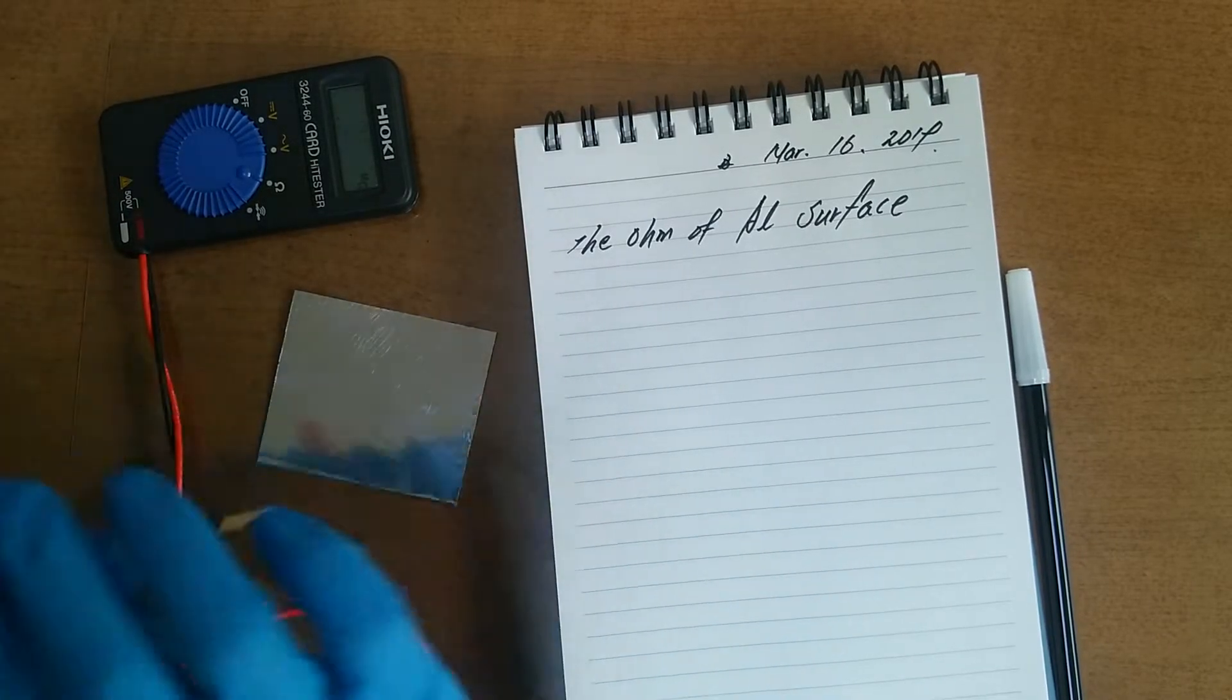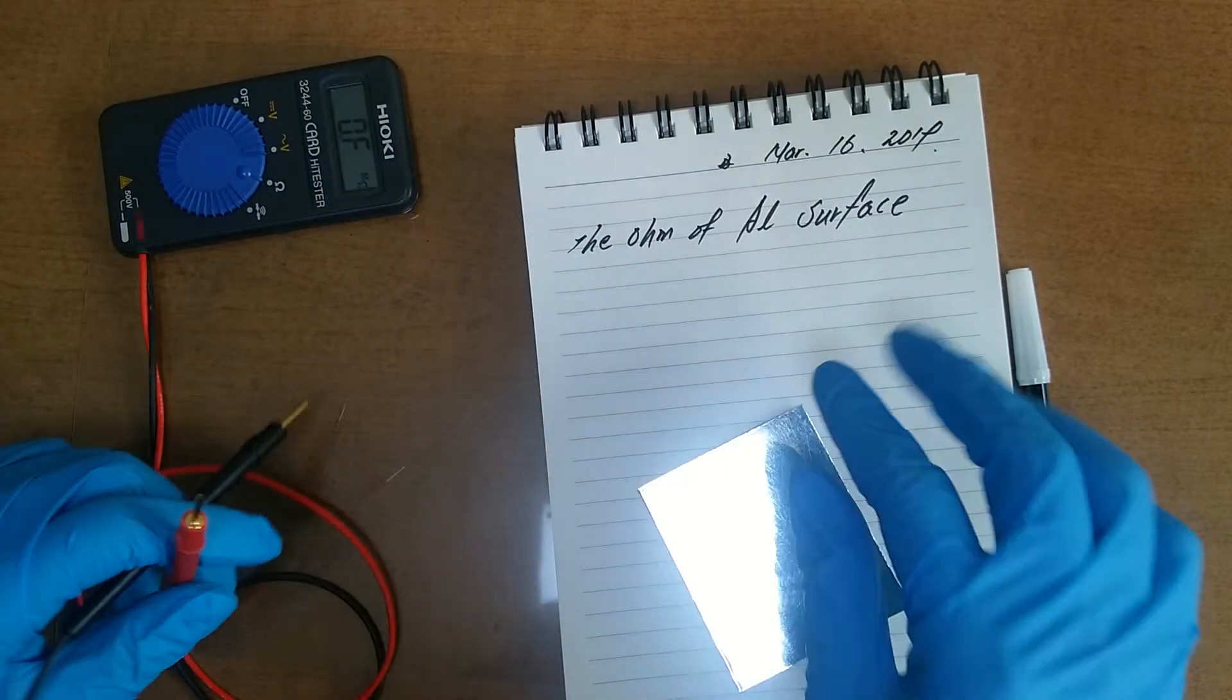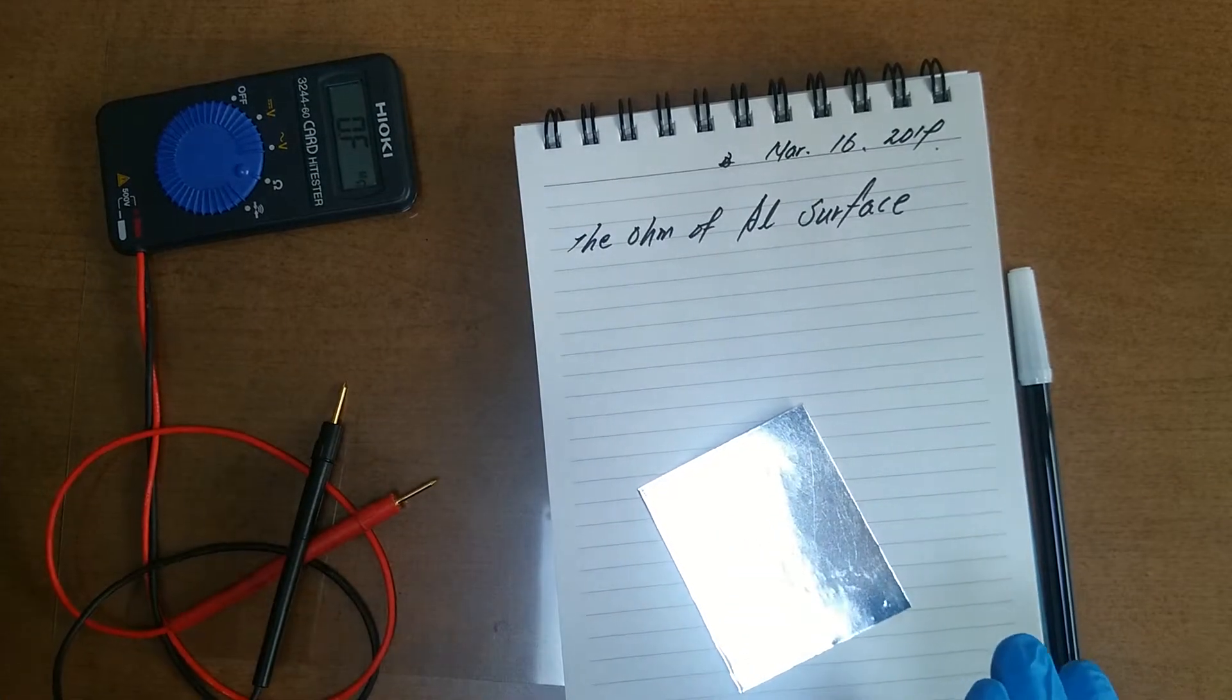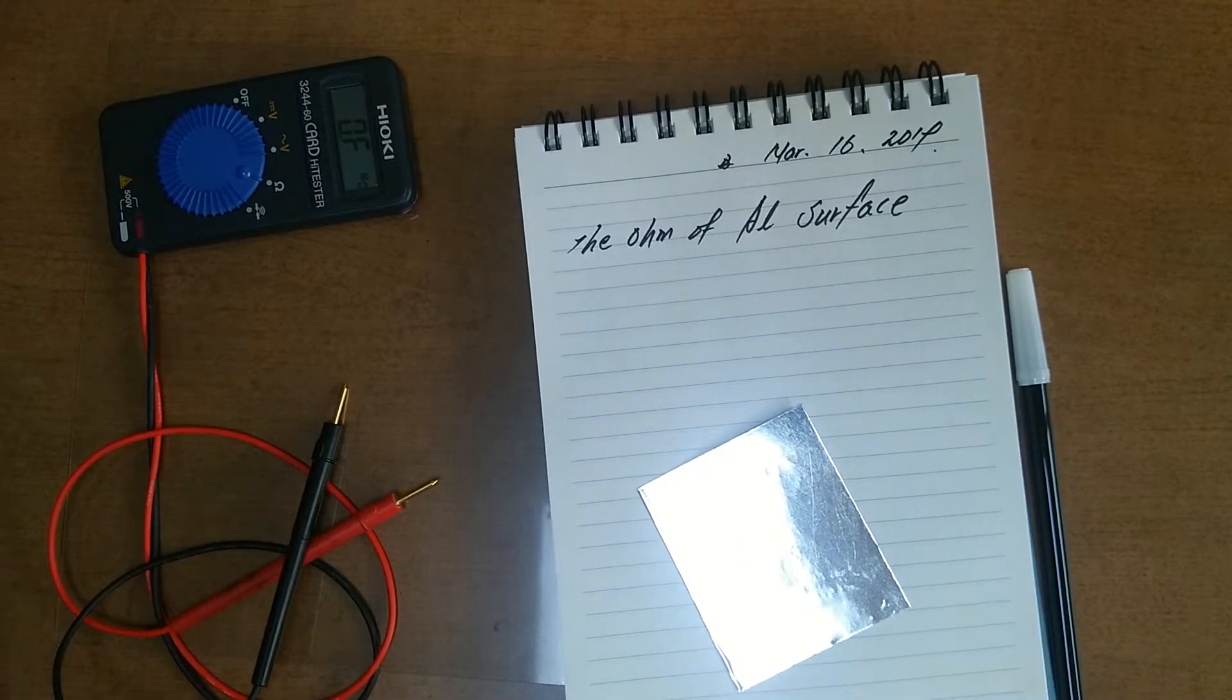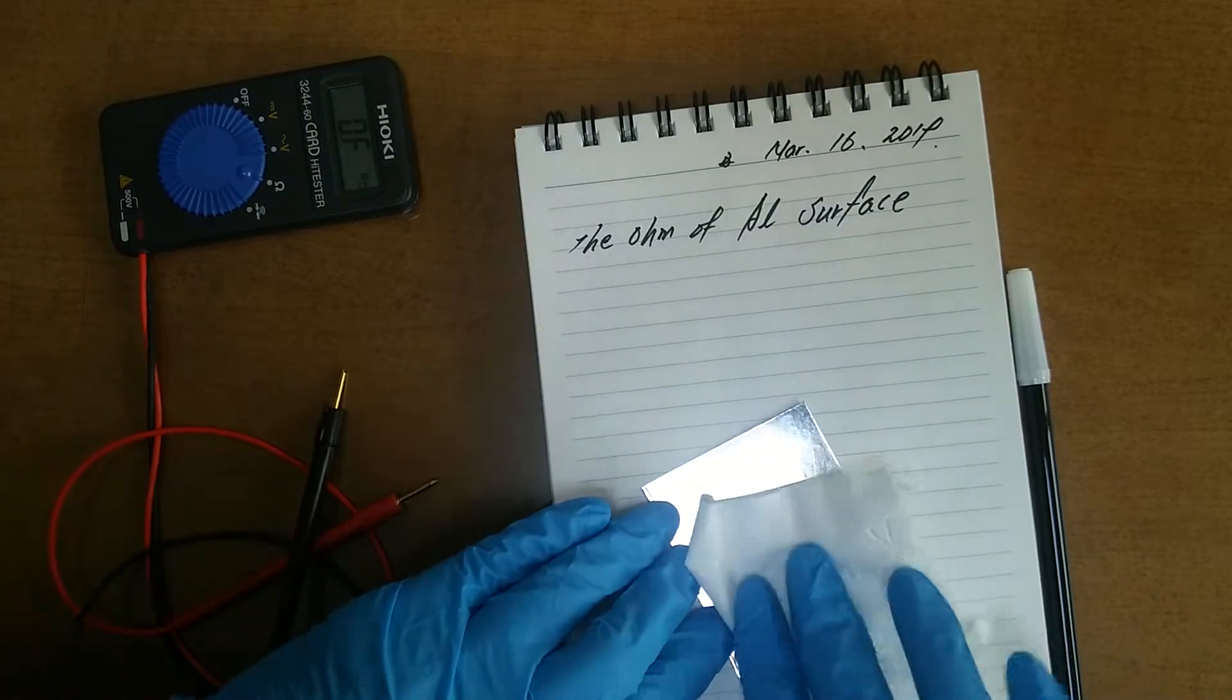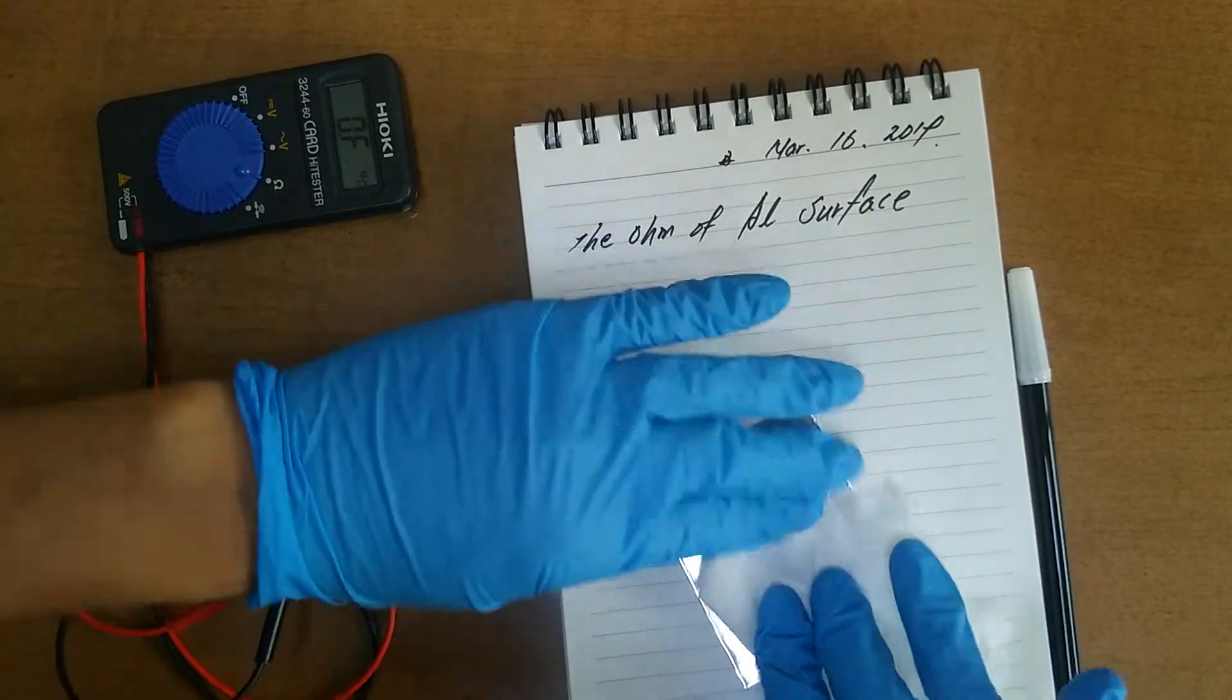Too high. Maybe there's... On the surface, there are some impurities, maybe.